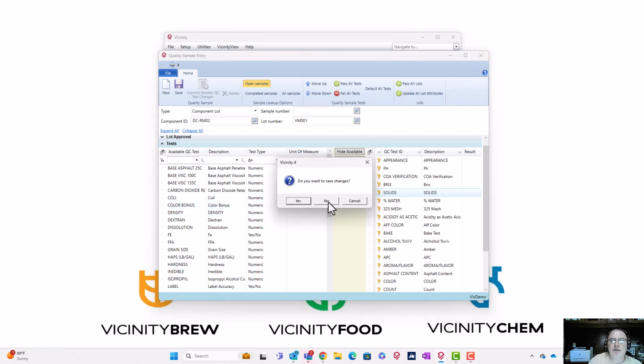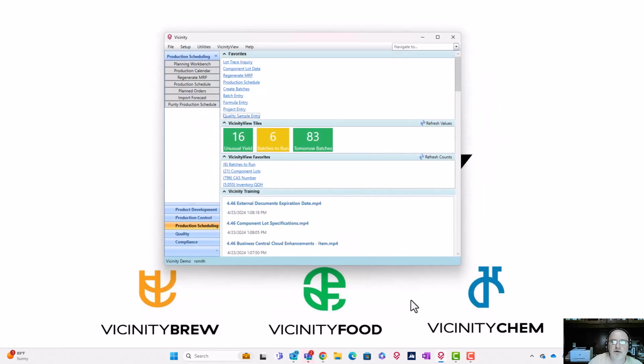So this came to us from a client using Quality. I think it's a great idea.